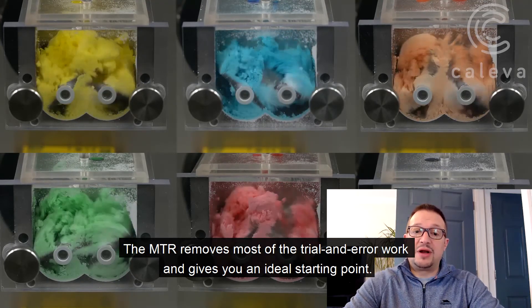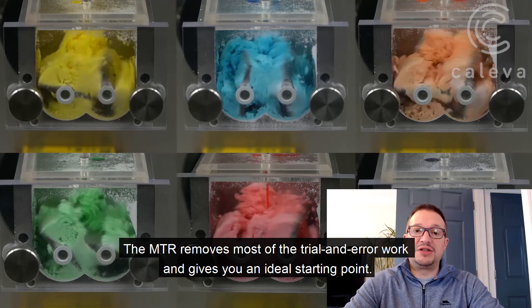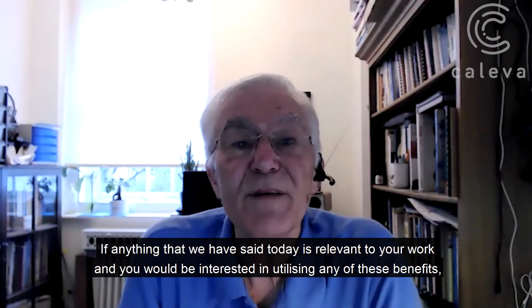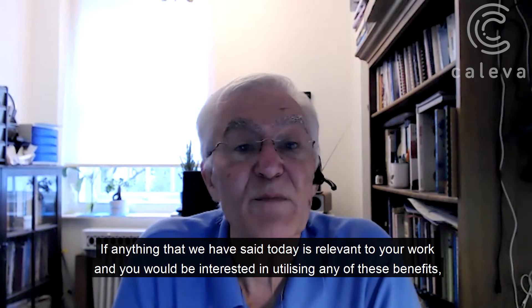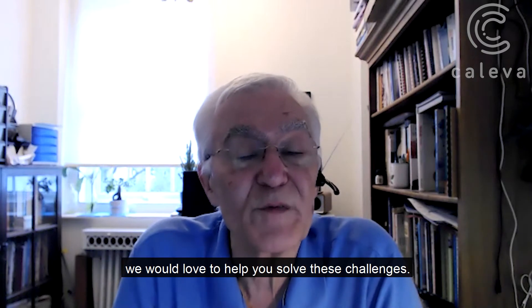The MTR removes most of the trial and error work and gives you an ideal starting point. If anything that we've said today is relevant to your work and you'd be interested in utilizing any of these benefits, we'd love to help you solve these challenges.